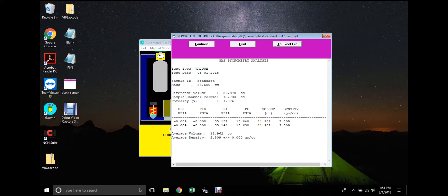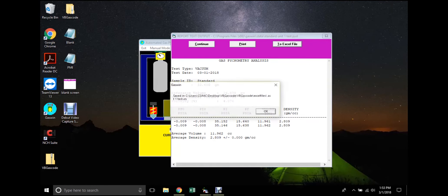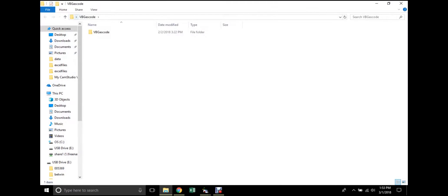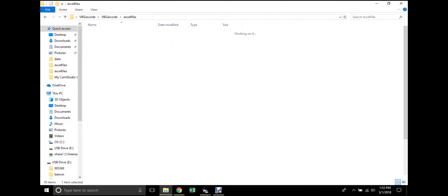The results may also be exported and saved as an Excel file by clicking the To Excel File button. The Excel file may then be located in the PMI Software folder.